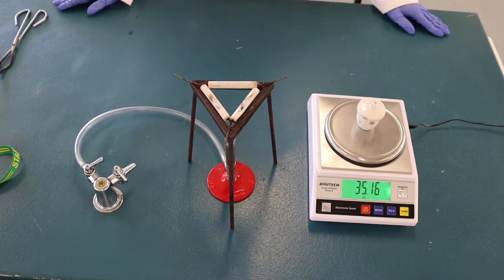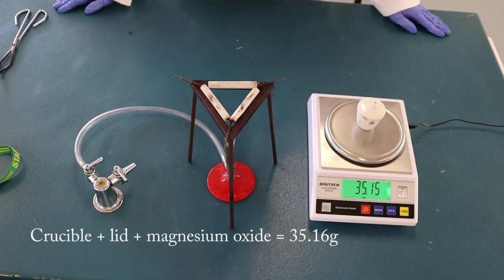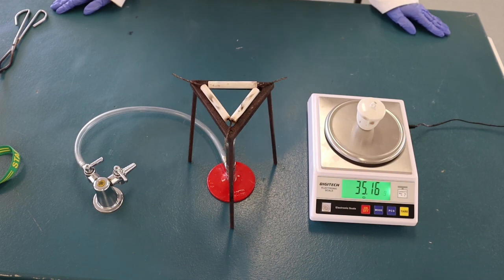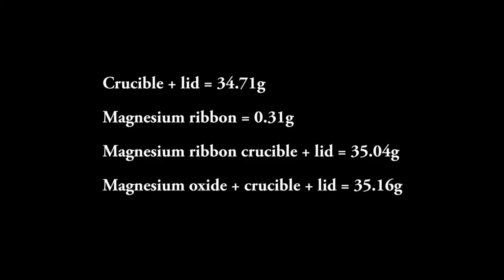The crucible lid and magnesium oxide weigh 35.16 grams. Now that I have given you the masses of each item weighed, you can go ahead and fill in your results table and complete your calculations.